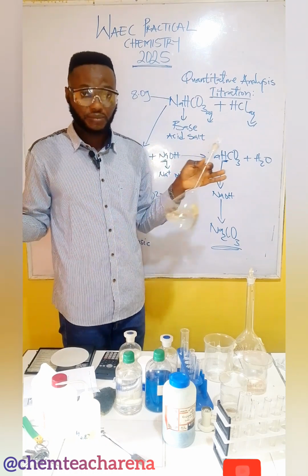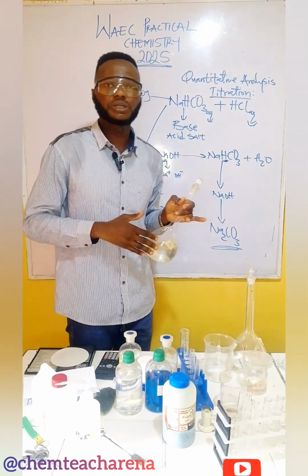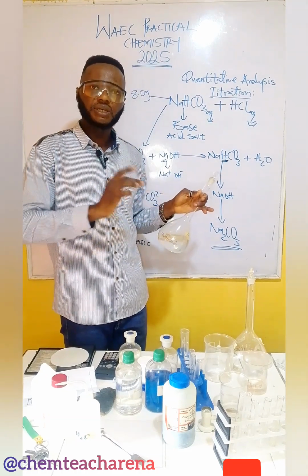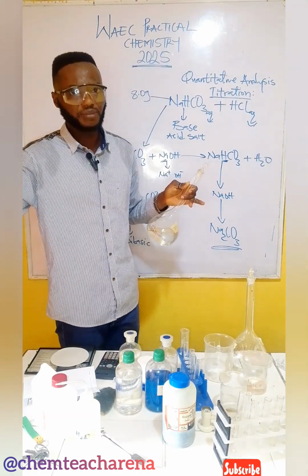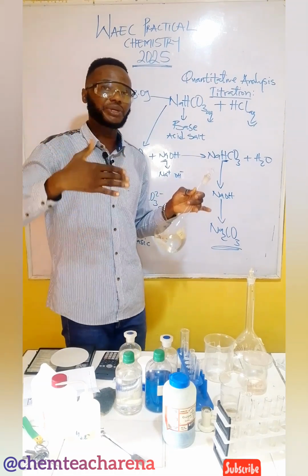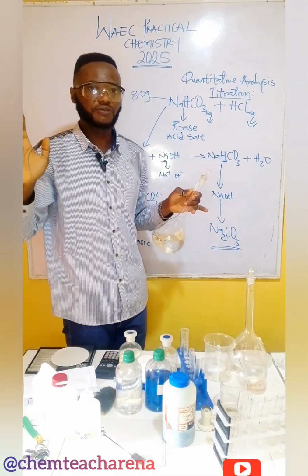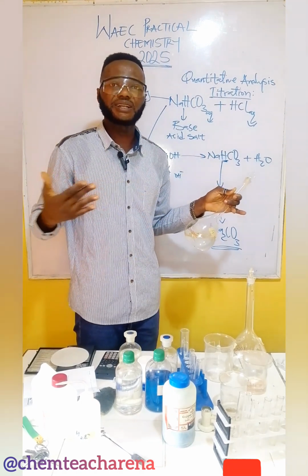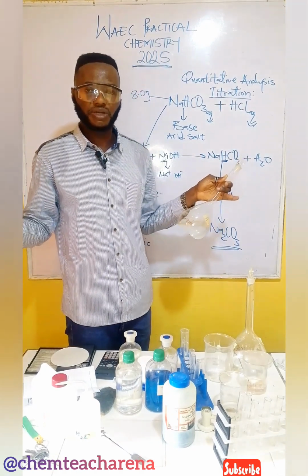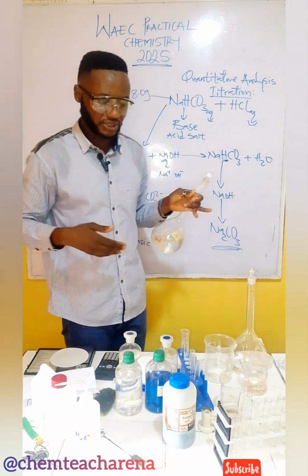I have not started preparing my solution, which I will do first thing Monday morning to teach my students before we prepare another fresh one for the exam, because for the exam we can't prepare it and keep it till that period. It's not advisable. It's not good enough. So I will first prepare to educate my students on likely questions and likely things that will come out. Then I will prepare a fresh one for them that morning again.